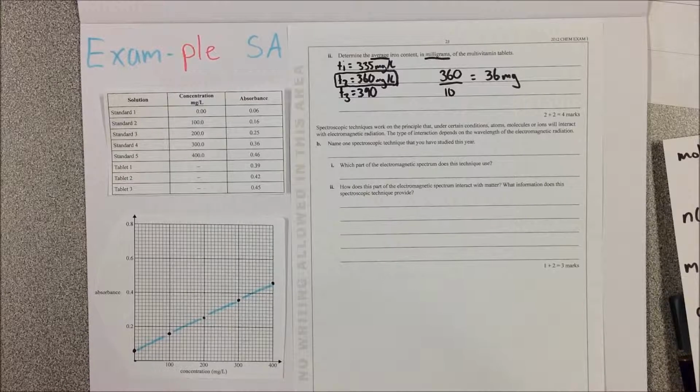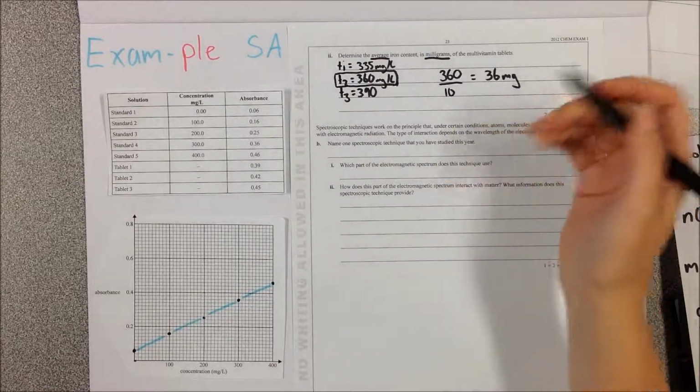Moving on, the next part is giving you a little bit of choice here. I'm going to pick the one that I think is the easiest to answer this question. So it's saying spectroscopic techniques work on the principle that under certain conditions, atoms, molecules or ions will interact with electromagnetic radiation. The type of interaction depends on the wavelength of the electromagnetic spectrum. So as you remember, each of our different types of spectroscopy use different types of radiation. So what I thought we could do is use our atomic absorbance spectroscopy, as that's what we've been using and that's what this video is about.